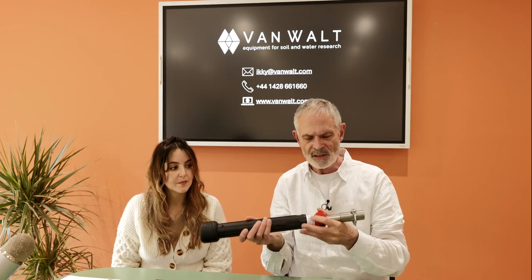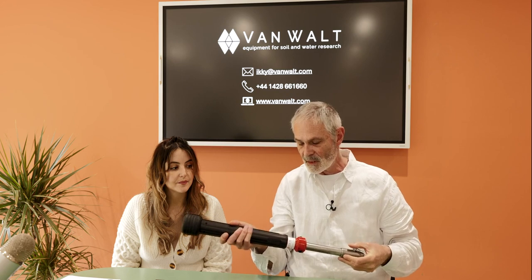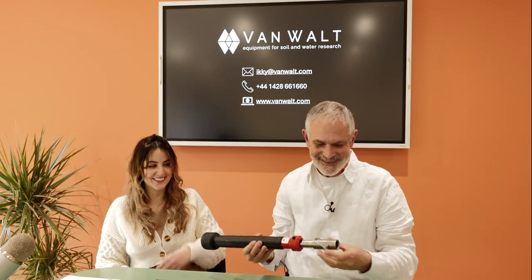Another accessory which is quite important in the sets that you will be seeing is a hammering head. Slide hammer. And again, on the one side, I'm trying to do this so I don't clonk you over the head with it.